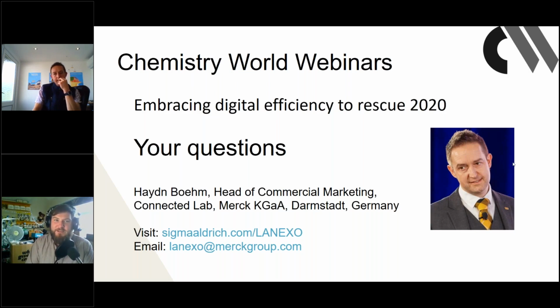Would a system like this, where you encode more data than you could possibly write on a bottle, actually make things more accessible to people who, for example, may have visual acuity problems? If you can scan it and get more information through a device where you can change the size of the text, that surely makes it easier for people who otherwise would really struggle to work in a lab.